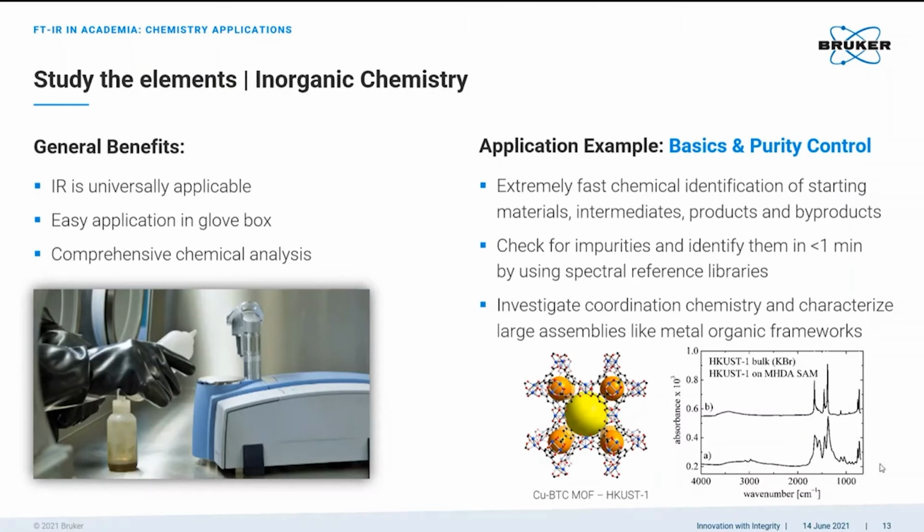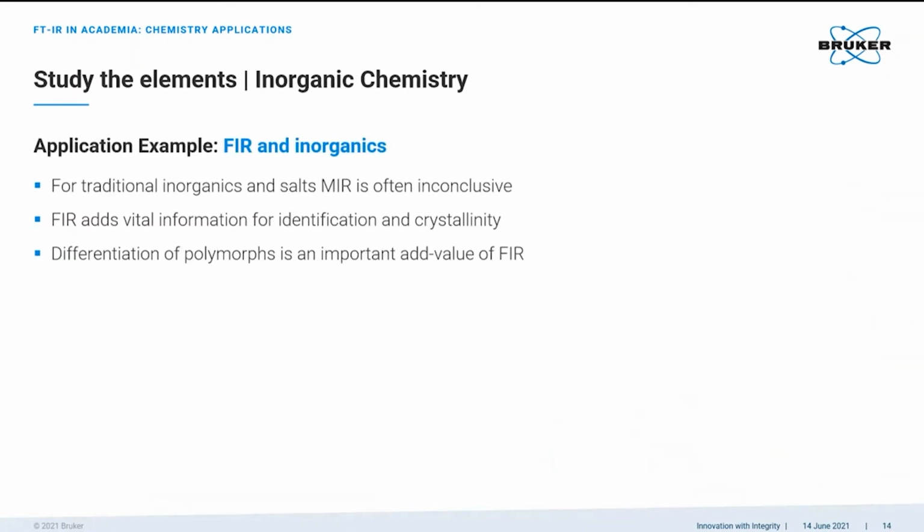And the broadening of the bands brought the researchers to the awareness that there are still residues of free ligand molecules remaining in the pores and interacting with the 3D framework, so that the crystallinity is less defined than in bulk.